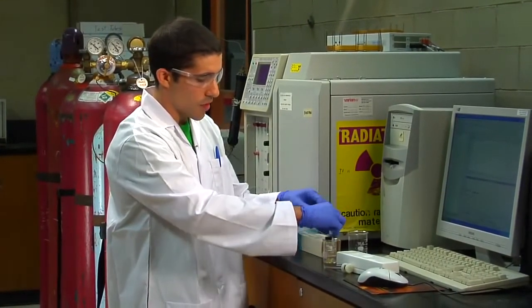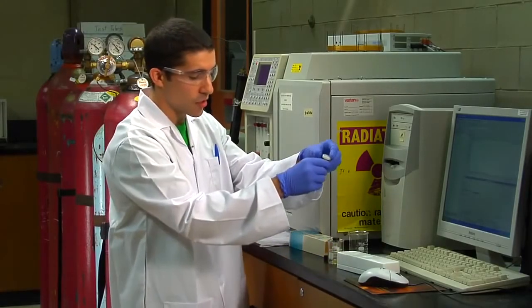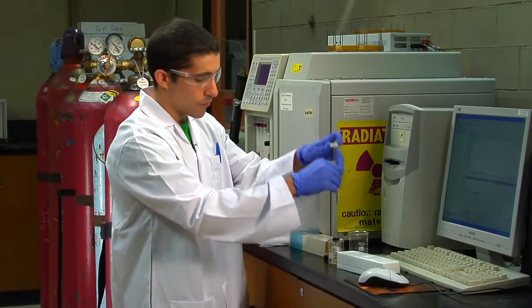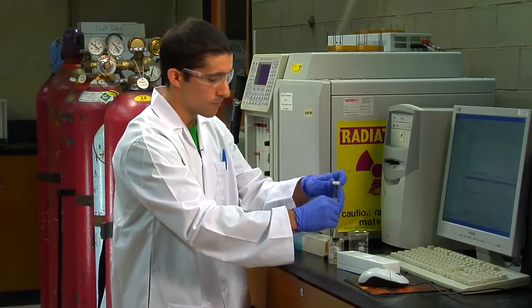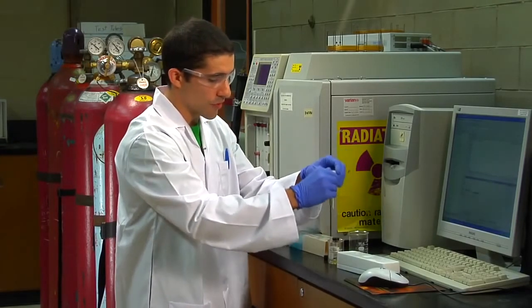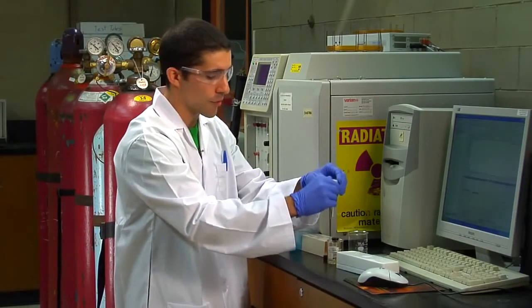open up this wash solution. You should have 2 vials here, one with your sample and one with just solvent, and that's just to clean the syringe. So you should clean the syringe 10 to 20 times to ensure that all contaminants are removed. You'll do that with both the wash solvent and the sample that you will be injecting into the gas chromatograph.